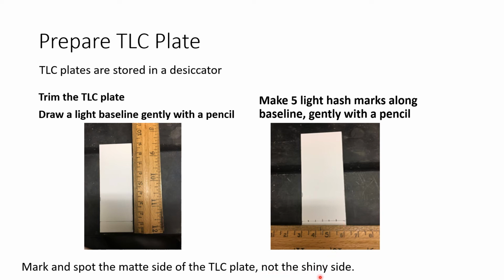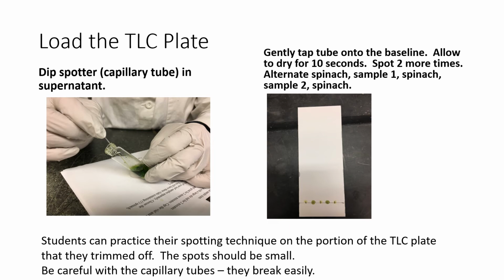Also check to make sure you are using the right side of the TLC plate. The shining side is actually the side without the coating. So do not use the shining side of the plate. To load the TLC plate, we're using capillary tubes.